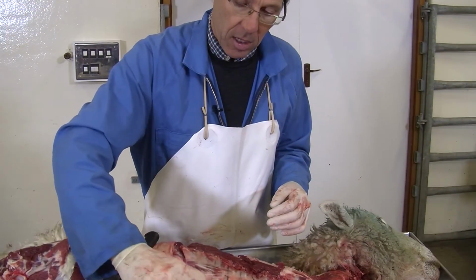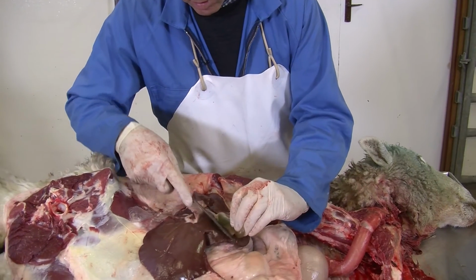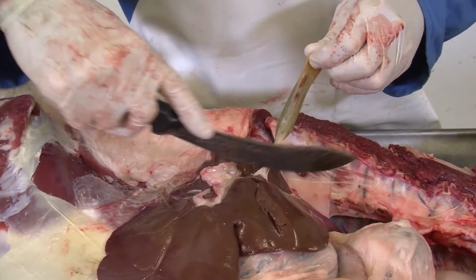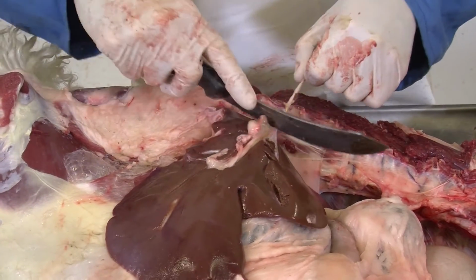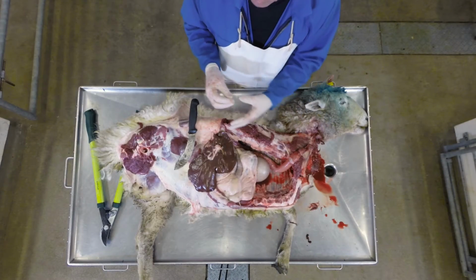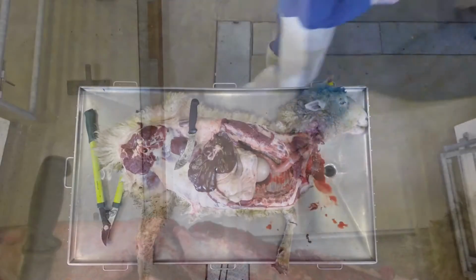And as I said, the waste products are stored here in the gallbladder, and they are then released into the small intestine. Now, some animals don't have a gallbladder. If they don't have a gallbladder, the bile is just flowing into the small intestine continuously. And I'll just show you what this bile looks like.